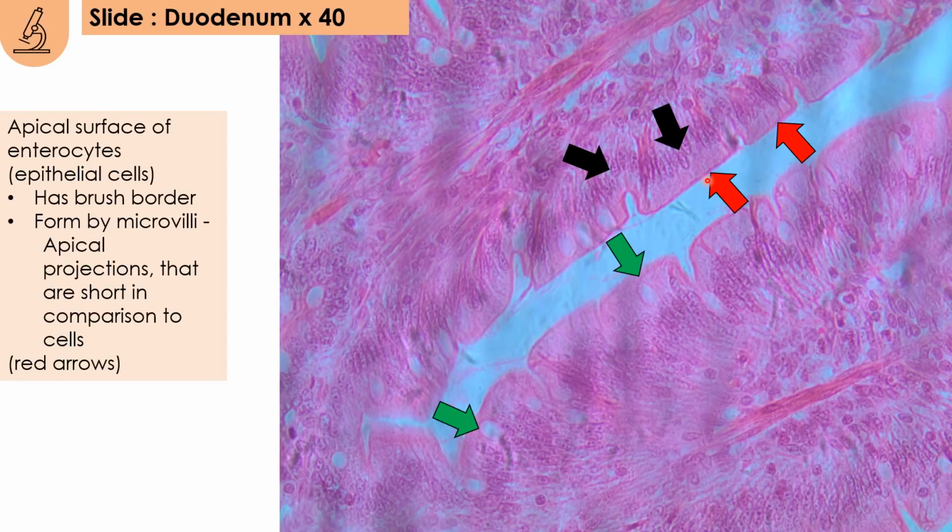Try to differentiate. This is microvilli. You can only see the microvilli clearly using electron microscope. You can't see the structure clearly using the light microscope; you can only see it present as striated border. But this structure here is a villus, and you can actually see a villus grossly.